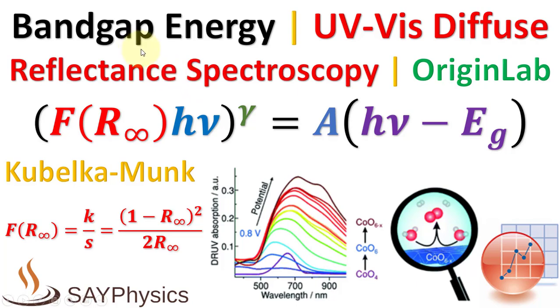In this video we will discuss how to calculate the bandgap energy from UV-based reflection data using OriginLab.